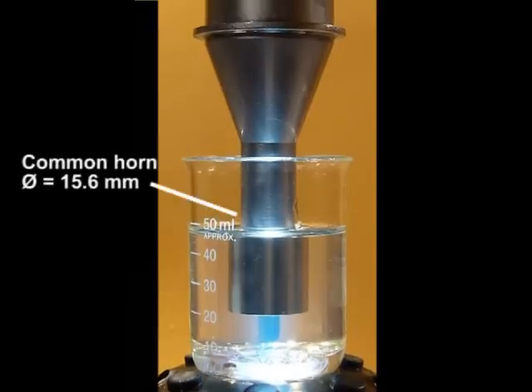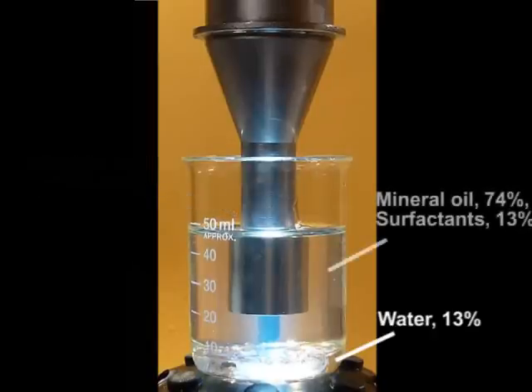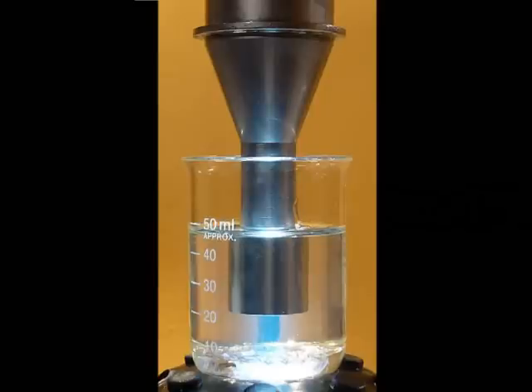We're going to make a nano emulsion using a common converging ultrasonic horn. It's going to start at about 30 microns peak to peak and ramp up over a period of about 20 seconds to about 65 microns peak to peak in amplitude. The formulation is 13% water, you can see it on the bottom, 13% surfactant combination, and the rest mineral oil.